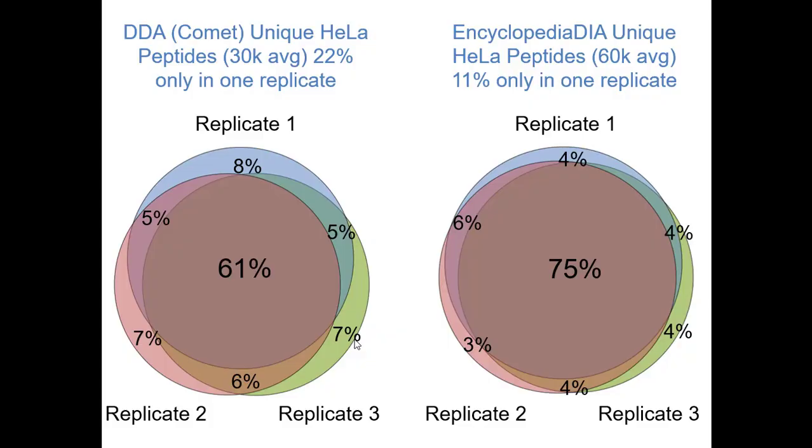Okay, so that's reason one why you might want to do this. Reason two is if you're already collecting DDA data, you already have a mechanism to do basically that same thing, which is to acquire an entire proteome's worth of data and ask questions of it one after another as you've done. So I think one of the best things that we've seen out of DIA is that it is substantially more reproducible in terms of the measurements that you make.